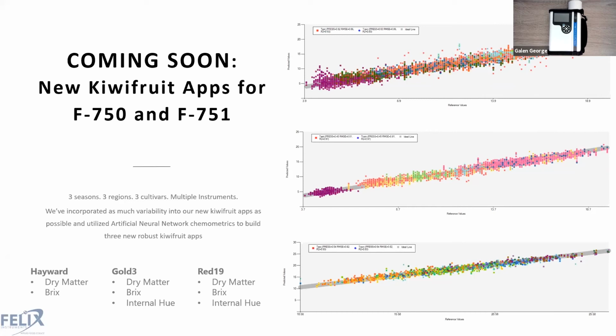And if you are curious about how the neural network stuff is an improvement over the PLS, I really encourage you to check out our previous webinar, which we did with our two guest experts from Central Queensland University, Dr. Kerry Walsh and Nick Anderson. They are leaders in the field of neural networking and chemometrics for post-harvest and harvest analysis of fruit. So it was a really insightful webinar to learn about how this neural network modeling works, if you want to learn more information about that.